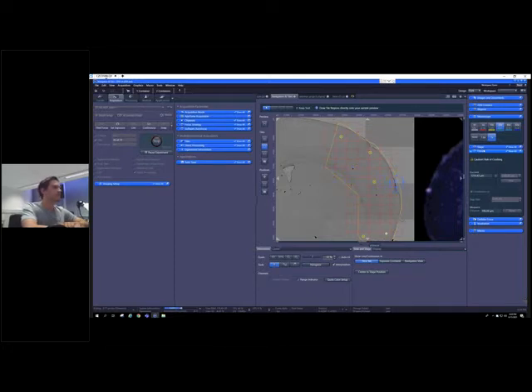And this is on the one hand side very fast, and secondly, it's very precise in terms of focus map. And you can also watch on the right hand side your objective revolver moving, so basically adapting for each of the tiles automatically the Z value.